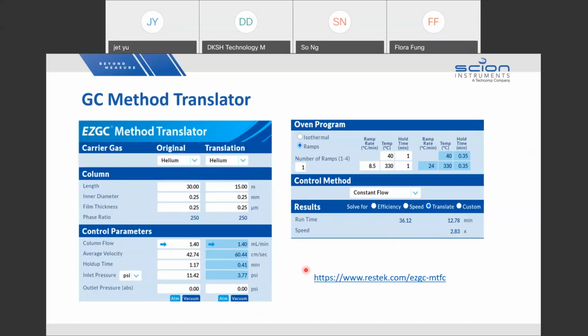Keep in mind that when you optimize conditions, you can refer to this free software and the curves I presented and showed you previously. You need to have very clear directions to go with. Then it will take you a shorter time to optimize the conditions, rather than struggling, changing it today and changing it tomorrow without any guidelines. That is more struggle for you. So this type of software is very useful for optimizing the method in order to achieve fast analysis.